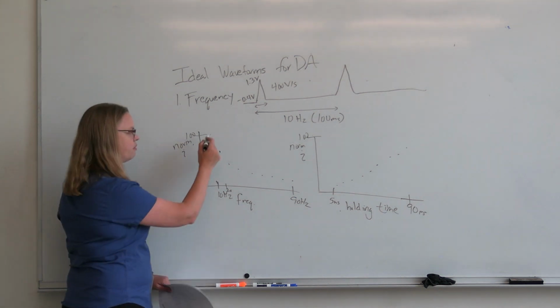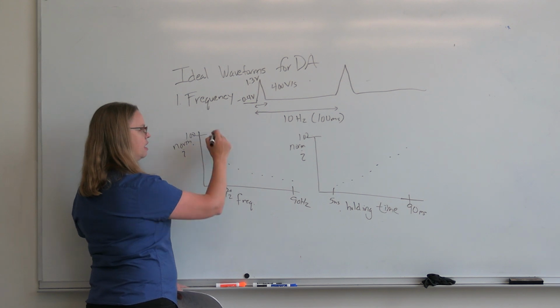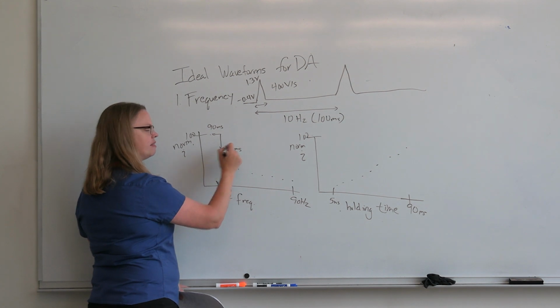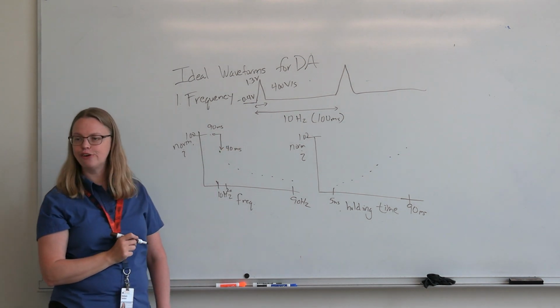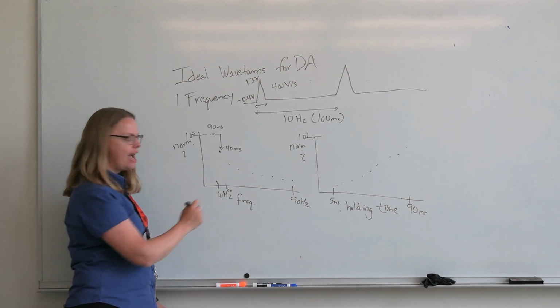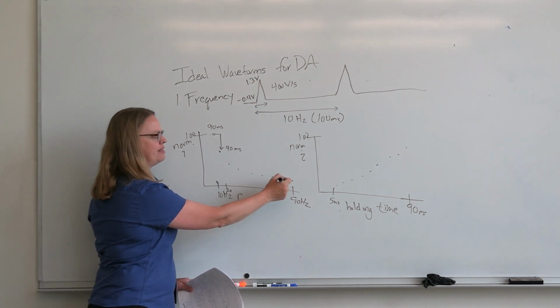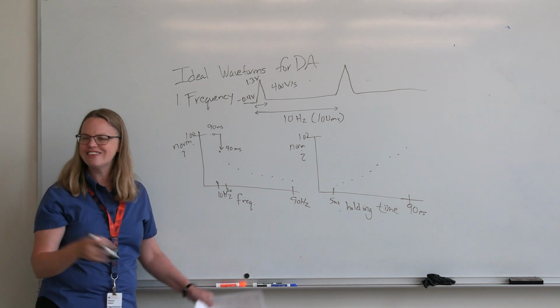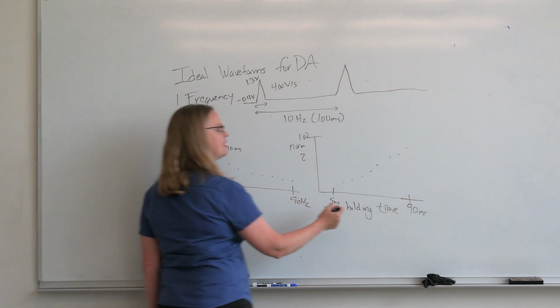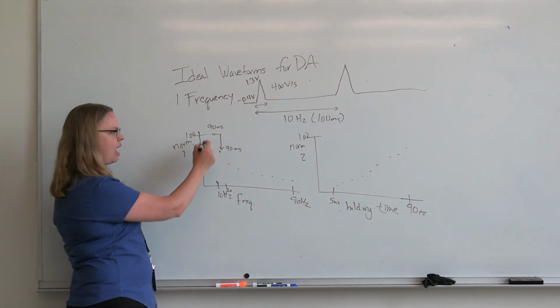One of the problems over here is just going from 10 to 20 hertz. This is about a 90 millisecond hold, and that one's about a 40 millisecond hold. So you lose half your holding time, half the time to absorb, which is why this is the most dramatic change. And then here, if you actually do these out, you're changing from like 7 milliseconds to 5, so it's not that big a change, which is why it kind of bottoms out. So if you did this by the time you held, I think it's probably a little bit more linear.